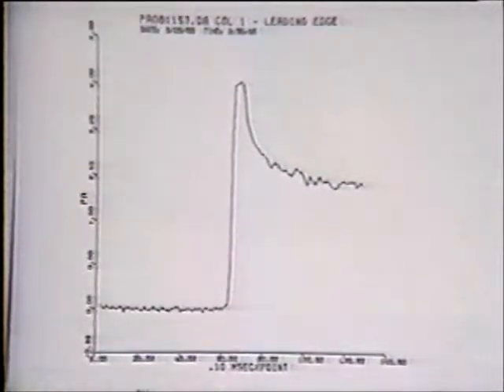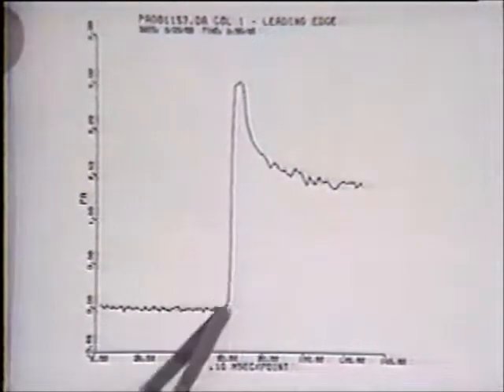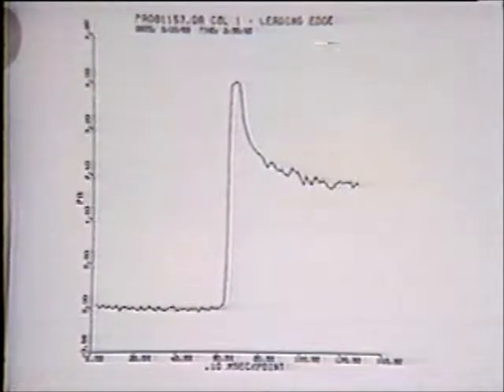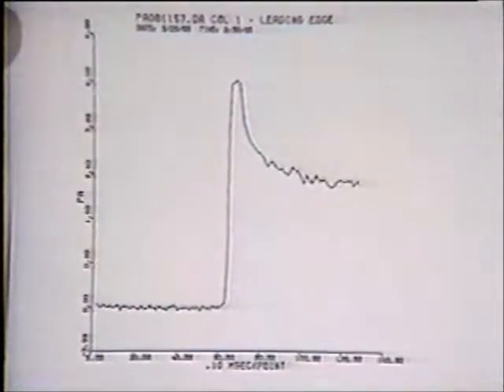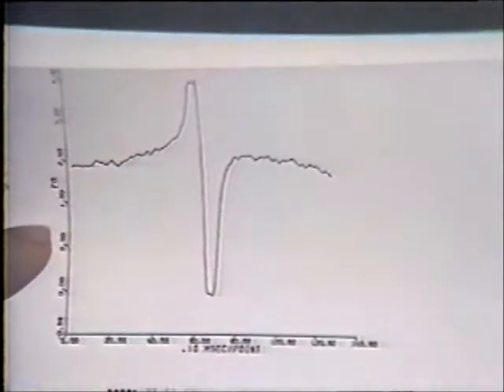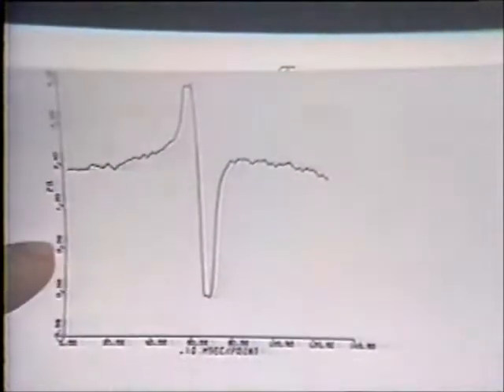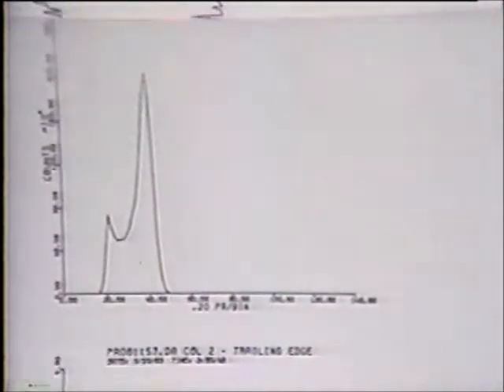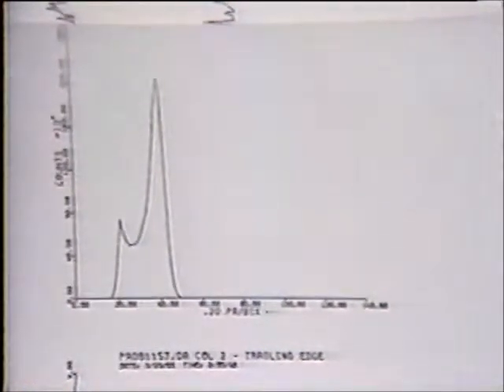The clean jump indicates that there are no substates which are unresolved occurring during the leading phase. We can make a similar analysis for the closure of bursts. We can do the same analysis for gaps within bursts. This is a plot of the amplitude distribution of all points selected to be within bursts, which is sometimes a help in looking at multiple conductance states within bursts.